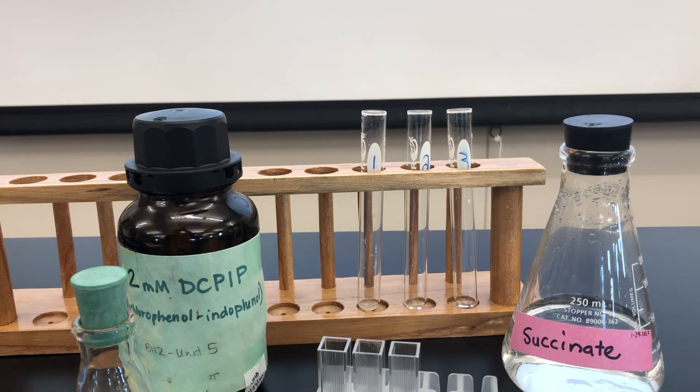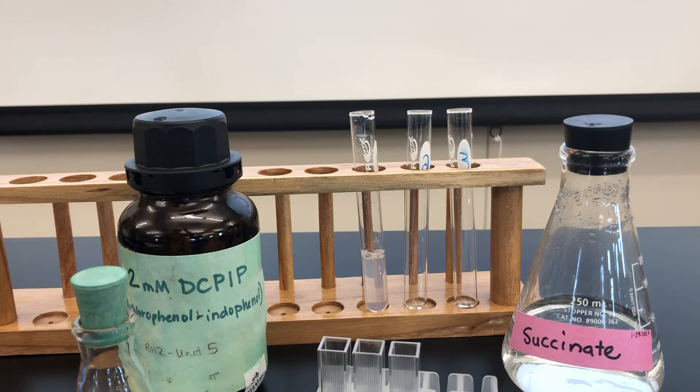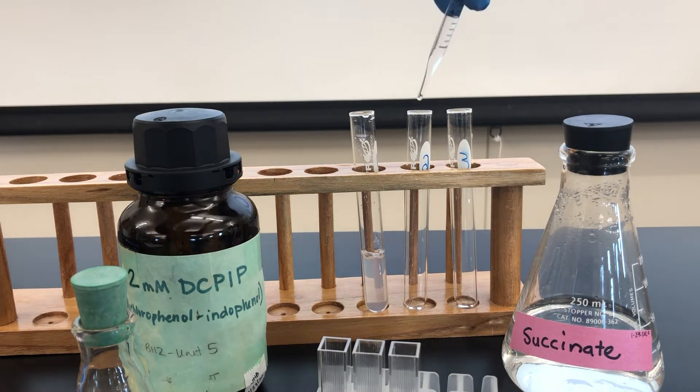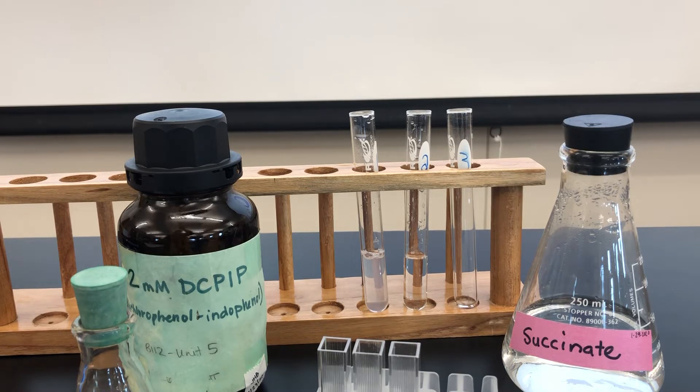So let's begin with our buffer first. Tube 1 should have 4.4 mils. In tube 2, we should have 4.2 mils. And lastly, tube 3 should have just 4 mils of buffer.